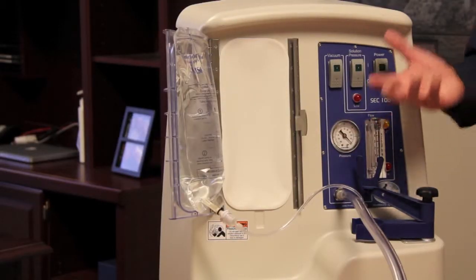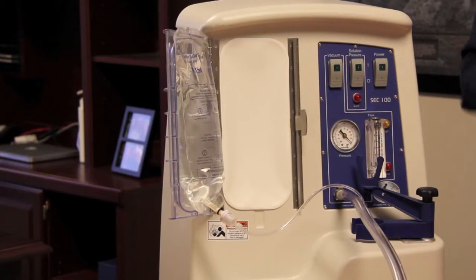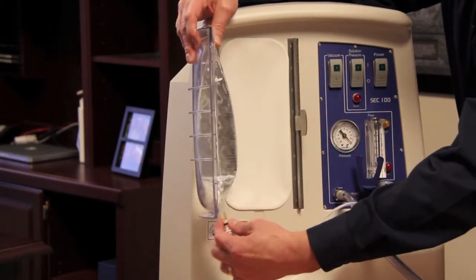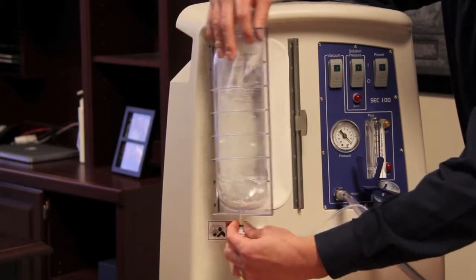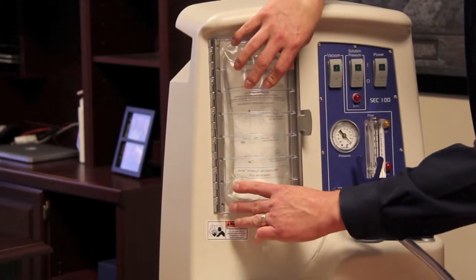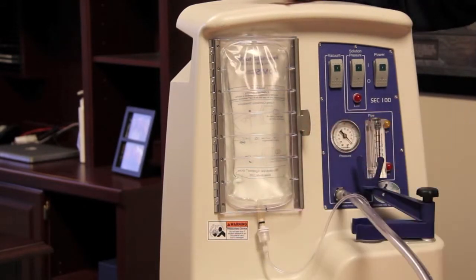Once everything is connected, you simply need to close the door and pressurize the solution. There's a small notch on the door — make sure the stem of the solution bag is inside of it. Then push against the bladder that's behind the bag, close the door, and make sure it's secure.